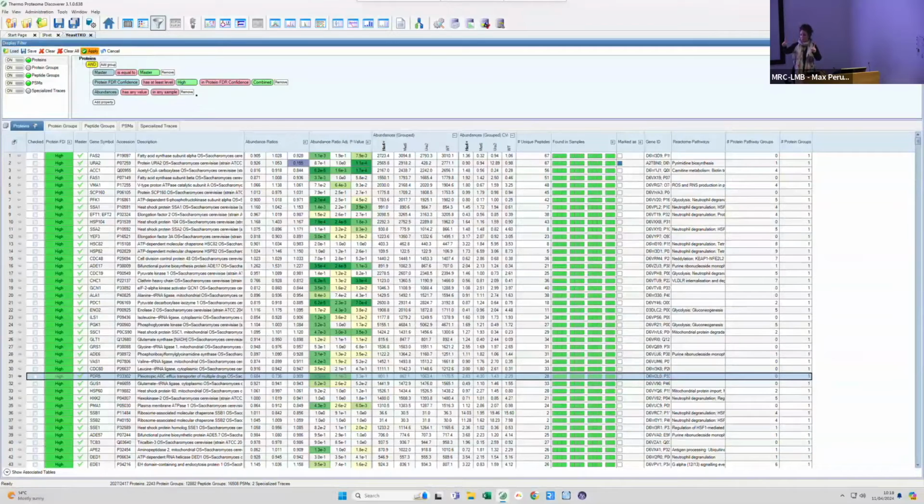Remember, identification and quantification. In this situation, you could care less about identification because you're looking at quantification. Our mass spec identifies and then it triggers quantification, and in some situations the quantification is really low. The signal to noise is really low. So we want to look at that.